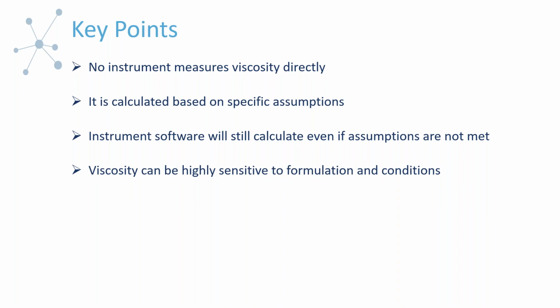Also, in the context of wanting to generate high quality data, it's always important to realize that viscosity is a very sensitive property, which is one of the reasons why it's so useful. It's very sensitive to small formulation changes and also conditions. By conditions, I mean temperature or small shifts in the environment. With all of this in mind, it's very important that you take a very critical eye towards your data. In reality, this is just good science anyway.